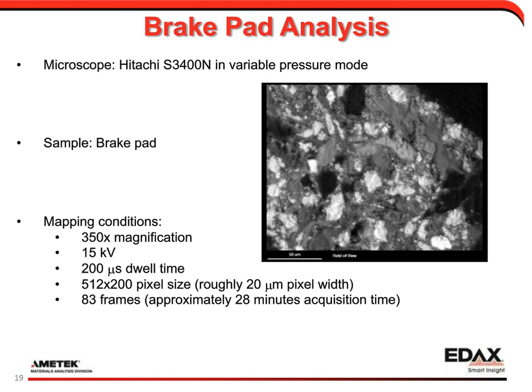So we have not included gold coating corrections at this point, but we're discussing whether it is something we want to include. The danger is, of course, that even though we correct for it, we still potentially introduce uncertainties in our correction factors. Simply, we are correcting for something, and that will introduce statistical deviations.